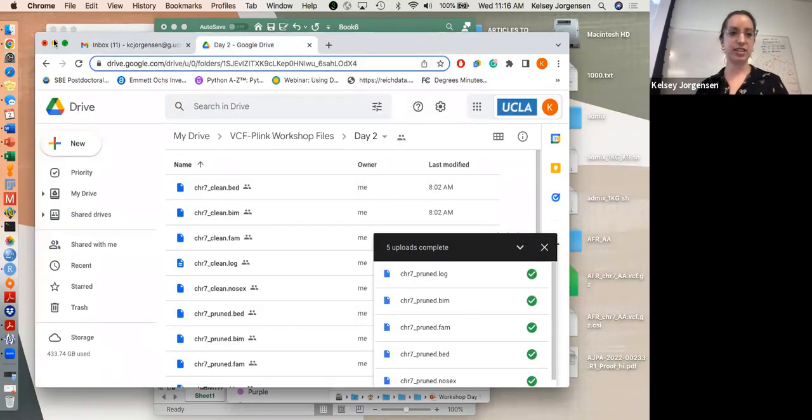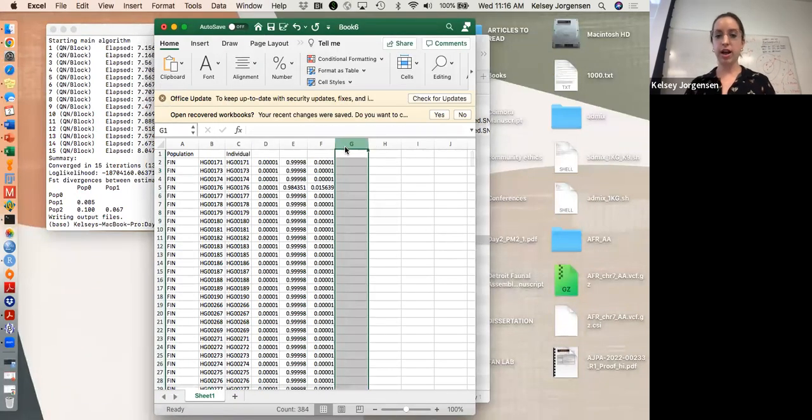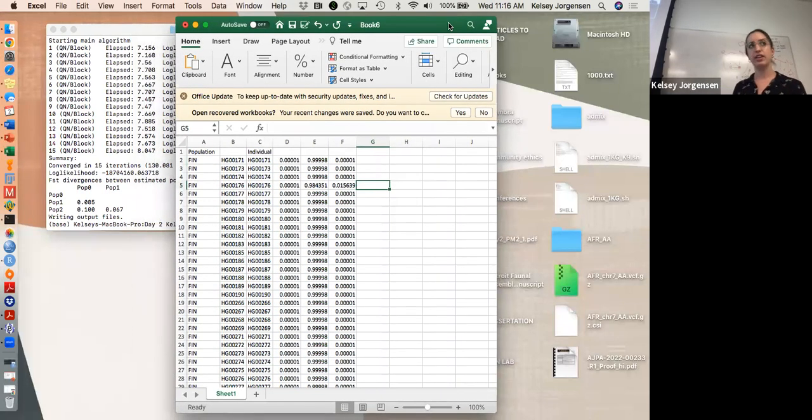Great. Okay, so hopefully you're all at this step. We have our population codes, we have our individuals. Now this is where you have to use your human best judgment. What I do is I look at the distribution of the percentages.